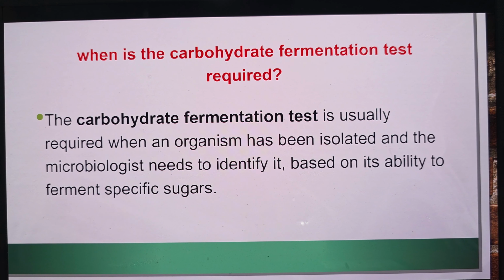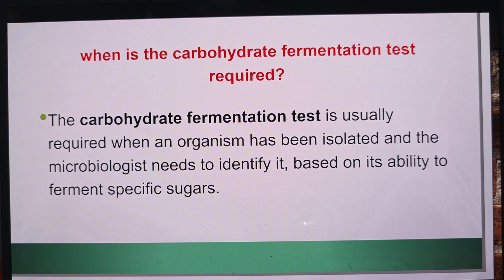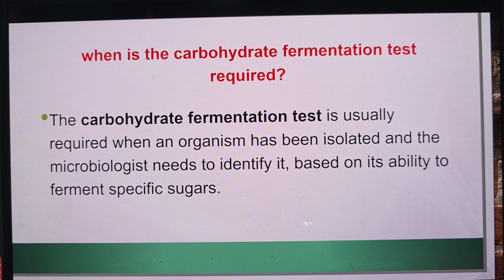When is the carbohydrate fermentation test required? The carbohydrate fermentation test is usually required when an organism has been isolated and the microbiologist needs to identify it based on its ability to ferment specific sugars.